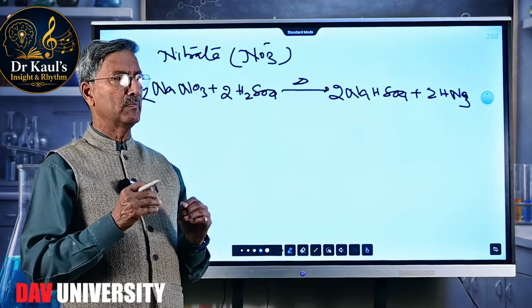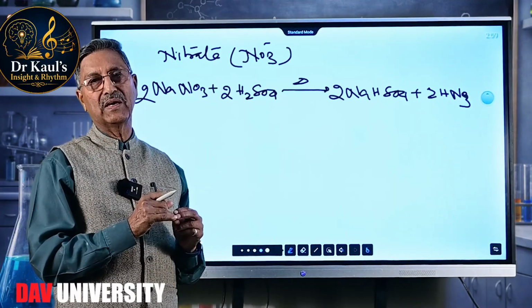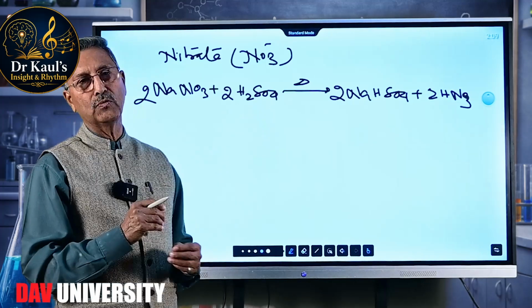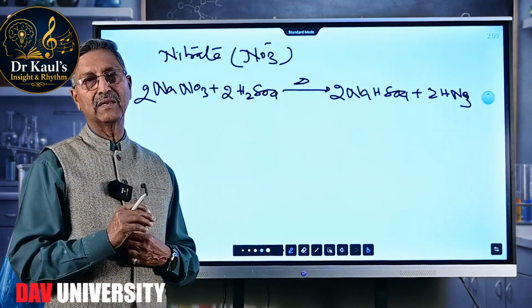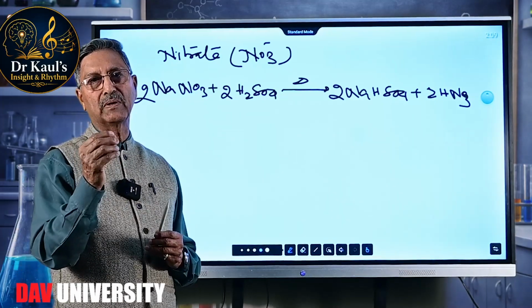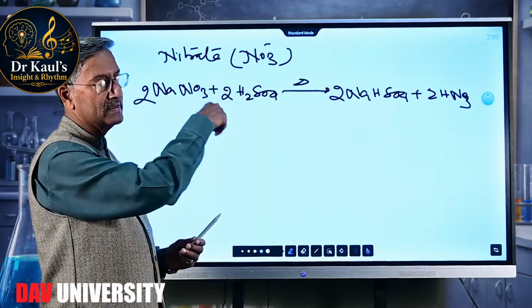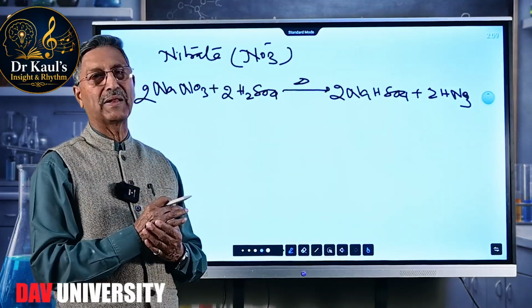It may confuse you whether it is from HBr or bromine or it is NO₂. The test for that is that if you add carbon to it, we generally tell you to add a paper pellet. What is a paper pellet? A piece of paper just rolled into a small ball and thrown in the test tube. The paper of this paper pellet is what?